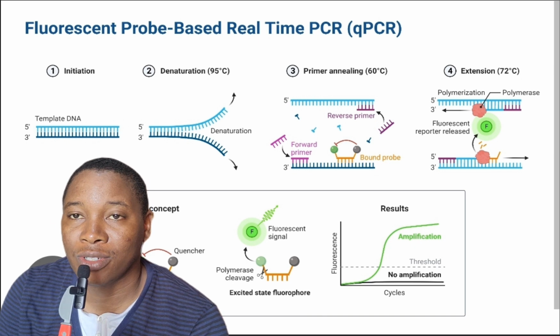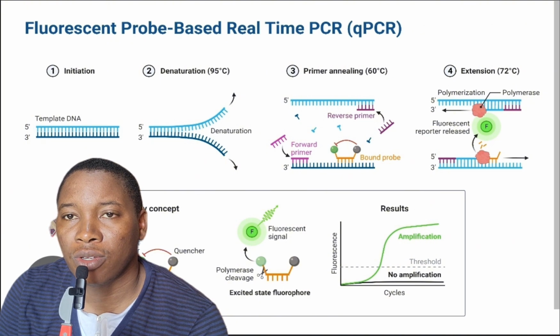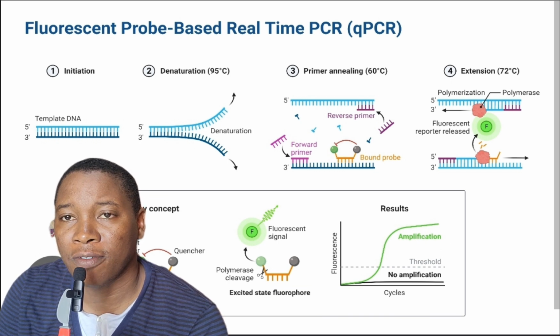Today, we are going to continue in our discourse. We've been discussing PCR, the very many different types of PCR. So, for today, we are going to be talking about real time quantitative PCR. And what is this? It's a type of PCR.